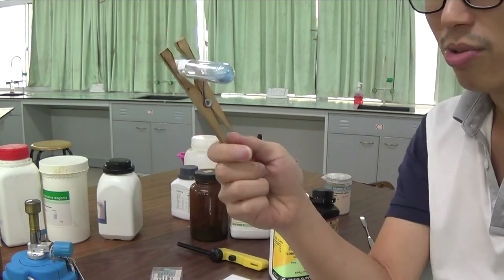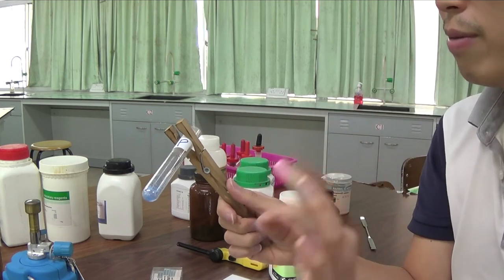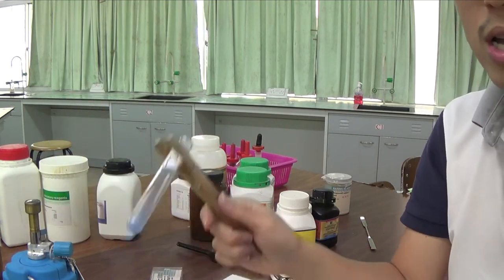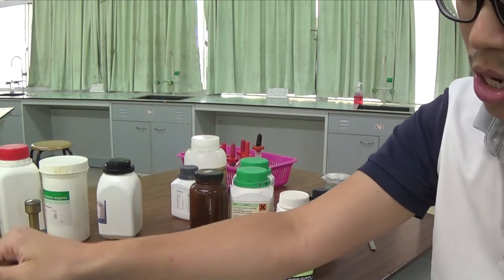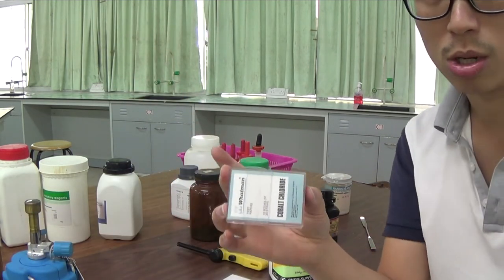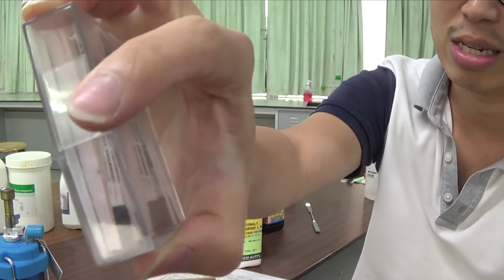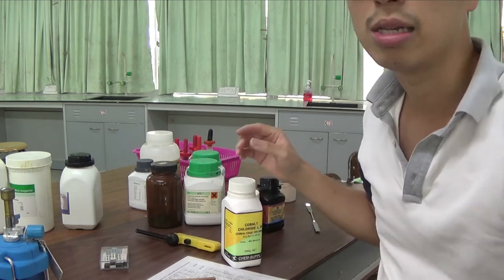When you add water to it, I don't want to add water straight away because this test tube is hot. You do not ever put water to a hot test tube. You do not ever wash a hot test tube straight away. You let it cool down a little bit. Later on, I'm going to come back and add water to it, and we're going to see the color change. Because cobalt 2 chloride anhydrous, meaning without the water of crystallization, is the test for water. Okay? So this paper is gone because I think it's been many years, so it's already all turned pink because of the presence of water vapor in the atmosphere.